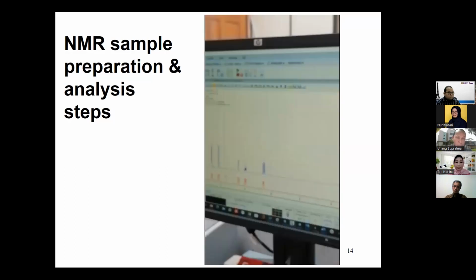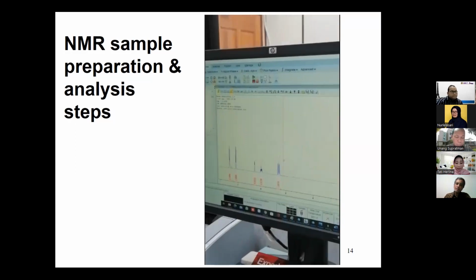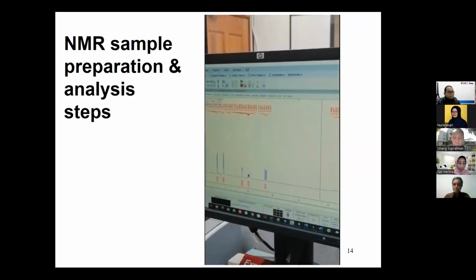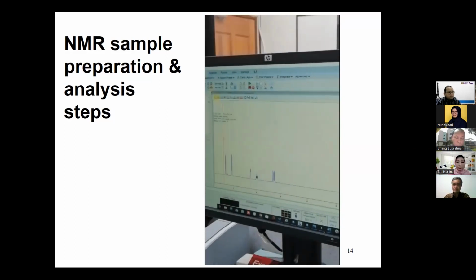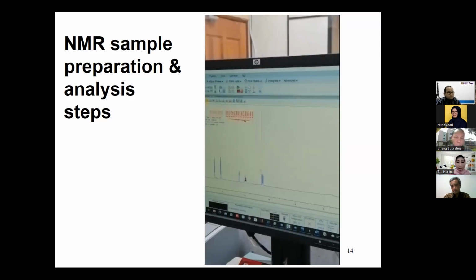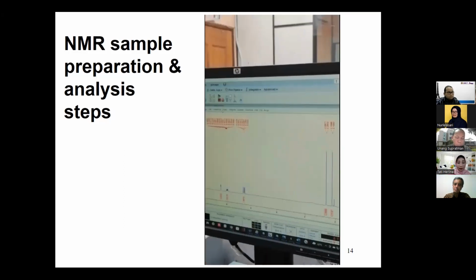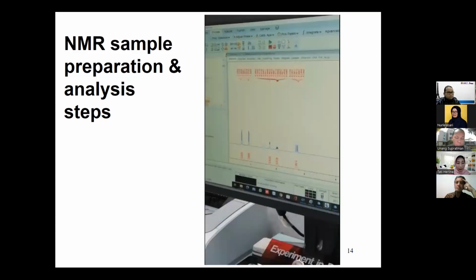It's this one. So it's going to be integrated on that. So we have to save this spectrum. And finally, we have the peak picking. Save. And this is how it looks. Okay, thank you very much. Bye-bye.